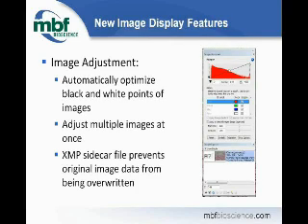Deconvolution, we were just asked by Rob Murata if deconvolution is available in Neurolucida or just Stereo Investigator. It's an add-on module, because not everybody needs it, but it is available in either software product.